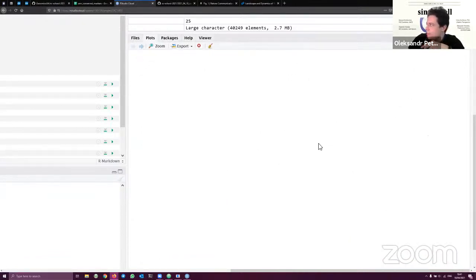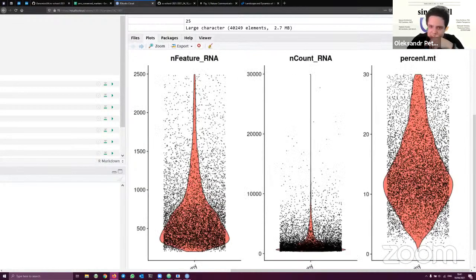And this one is from healthy liver. Could it be because they are diseased? I mean, they have a disease, and that's why they have a higher content of mitochondrial genes. That's actually a very nice suggestion, and it probably may impact some of the data sets.